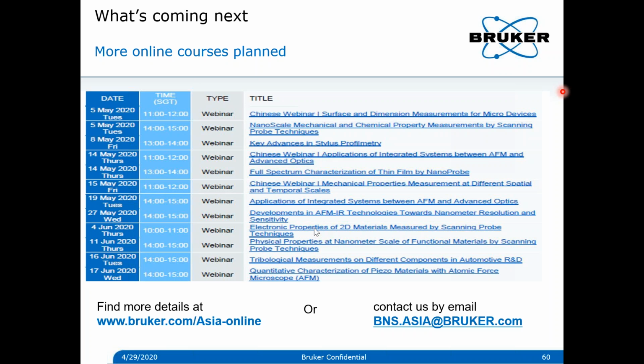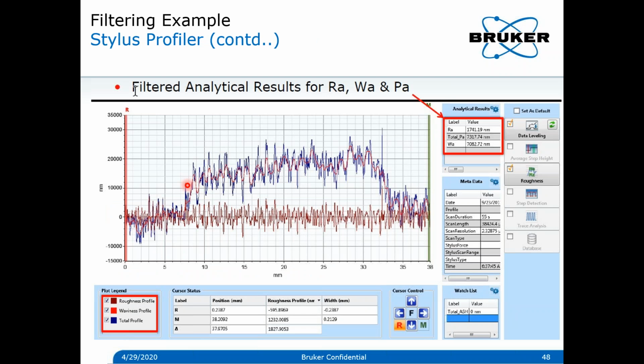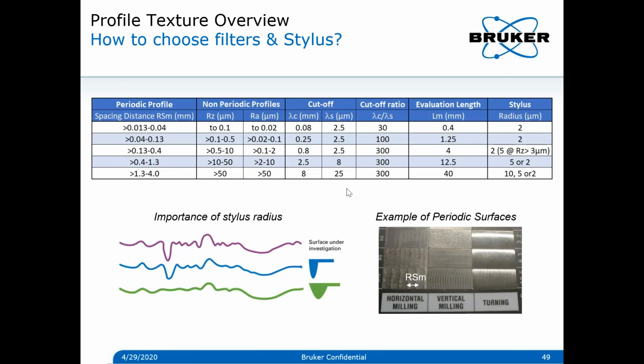That's the first question, Dr. Aisha. Yeah, so typically one needs to have an understanding of the process to better decide the cutoff, as we mentioned earlier in the stylus profile slide here. So this will give you an understanding of which kind of numbers you have to use.